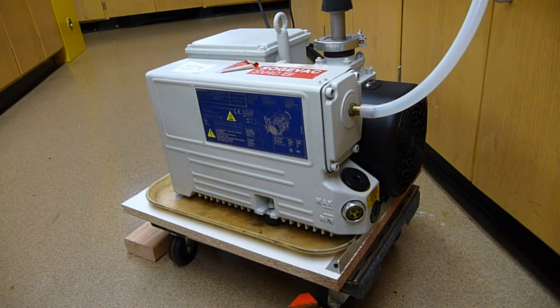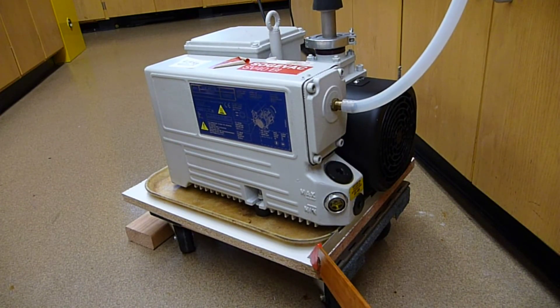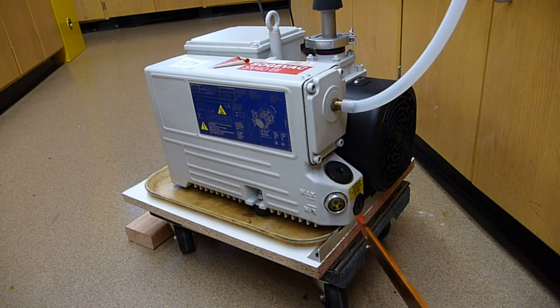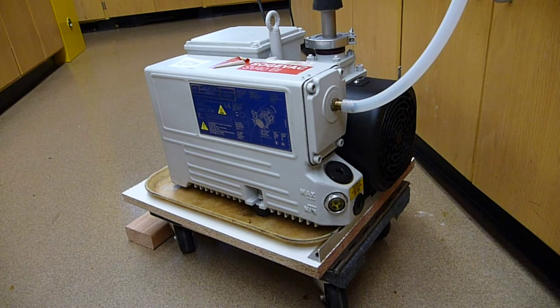This video is about the movable base for our second rough pump. This is our standby one, and one of the advantages of having a second rough pump is that you can have the oil changed beforehand. Because this rough pump is 43 kilos in weight, having something that facilitates the changing of the oil is a plus.